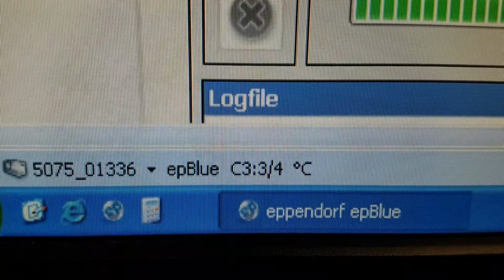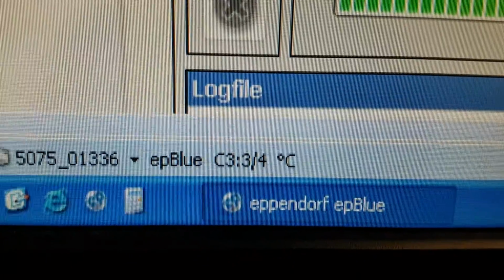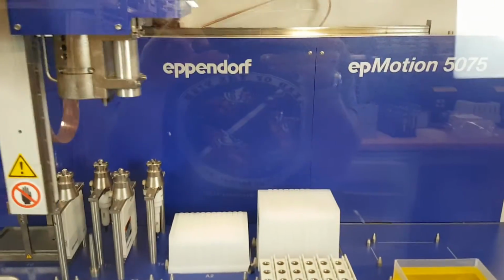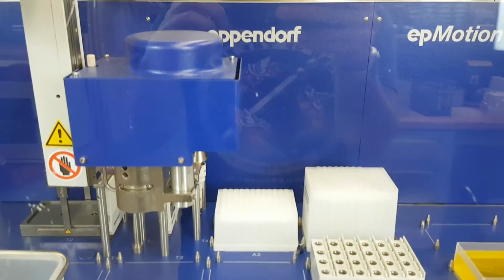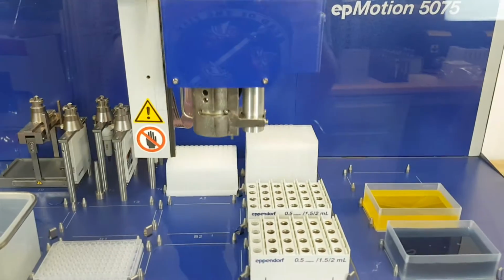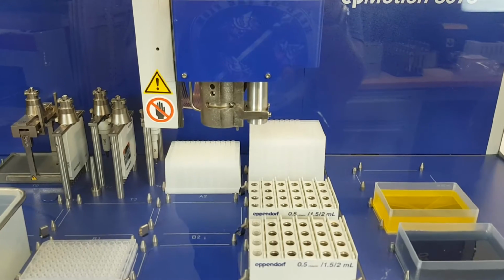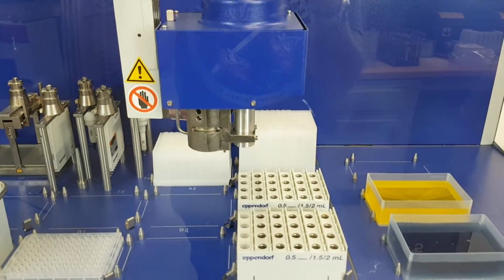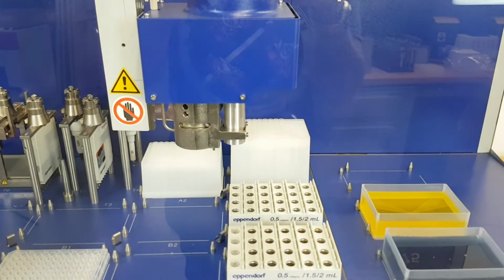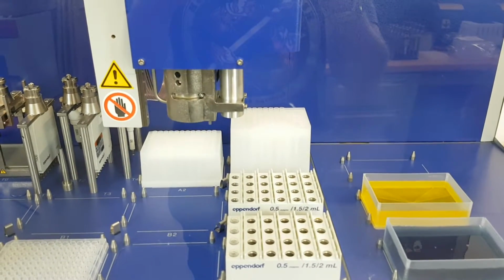While it's doing that, I'm gonna show you guys that the temperature on position C3 is currently 3 degrees. We pre-cooled it to save some time, but we will show how it gets heated a little bit later. So right now it's checking the level of liquid to make sure that there isn't an overabundance of liquid in any position.